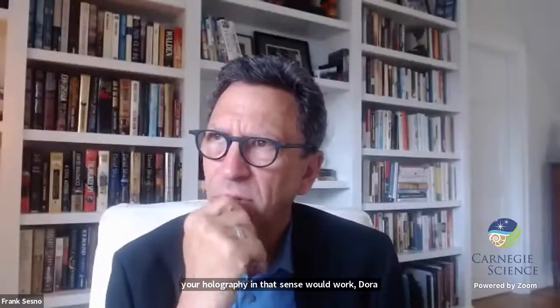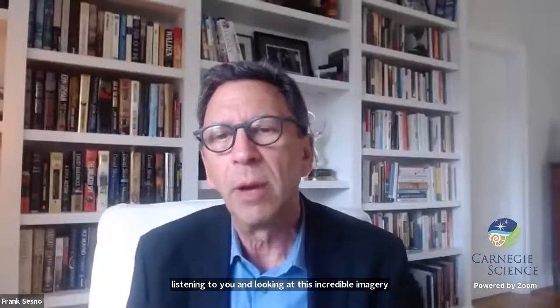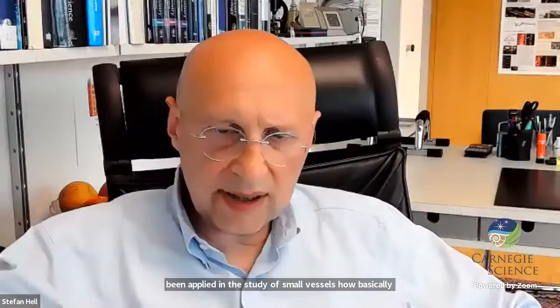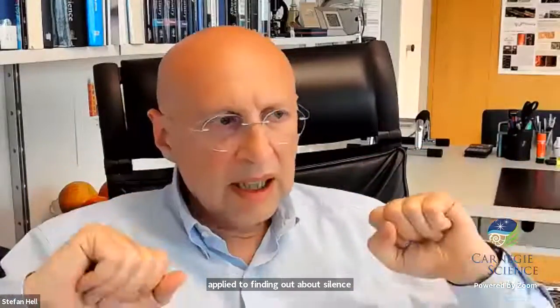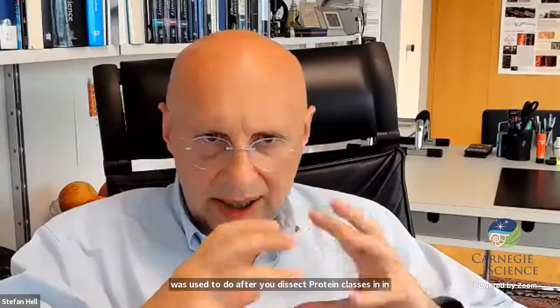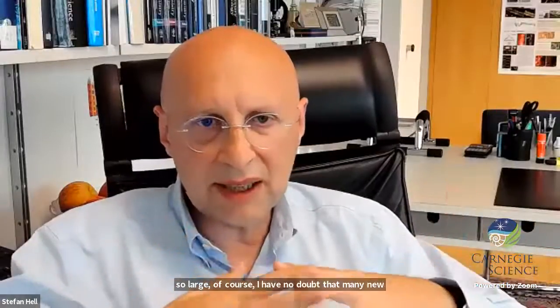Doris asked a question that probably a lot of folks listening and looking at this incredible imagery and the resolution revolution might have: what insights into biological systems has this technique provided? Answers to questions that could not be answered before? We are at the beginning of that. This has been applied in the study of small vesicles, how vesicles fuse in neurons, for example. It has been applied to finding out about the cytoskeleton in neurons. It has been applied to mitochondria, especially the last technique, MinFlux, that I showed, which was used to optically dissect protein clusters in the so-called cristae of the mitochondria. That's a technical term. Due to the fact that the resolution improvement is so large, I have no doubt that many new discoveries will be made as a result.